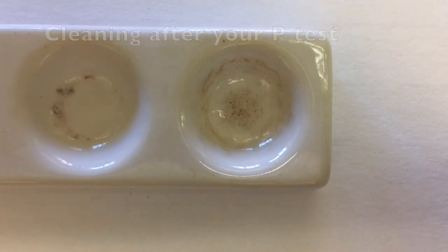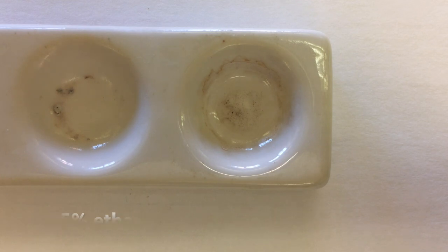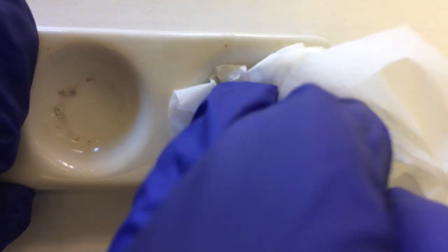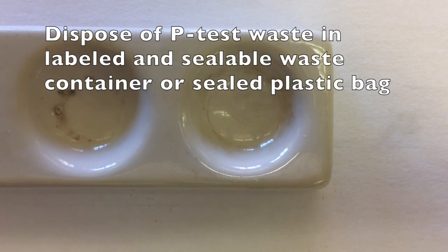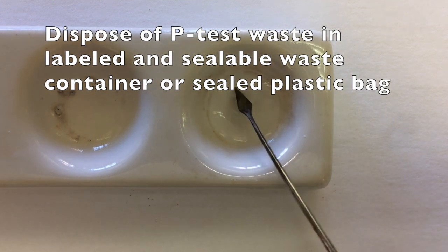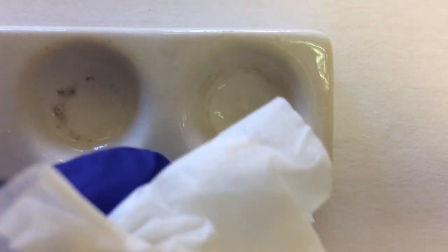When all your P testing is done for the day, it's important to clean your wells and your work area using ethanol. Be sure to dispose of any tissues that came in contact with P in a separate container. I like to use a plastic sealed bag.